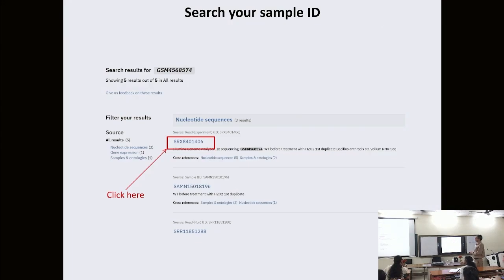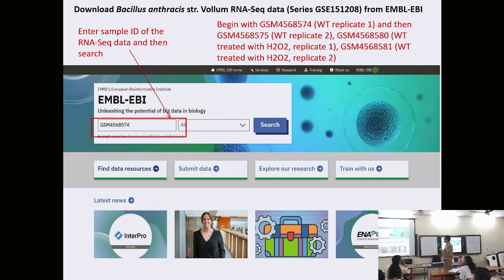And yeah, this is the pipeline that my PhD student has set up for you using RNA-seq data from a bacterium. And he told me that it's a small data set, so students should be able to download and run. But still it is so large actually. I tried to do it myself, and Galaxy was giving some error.